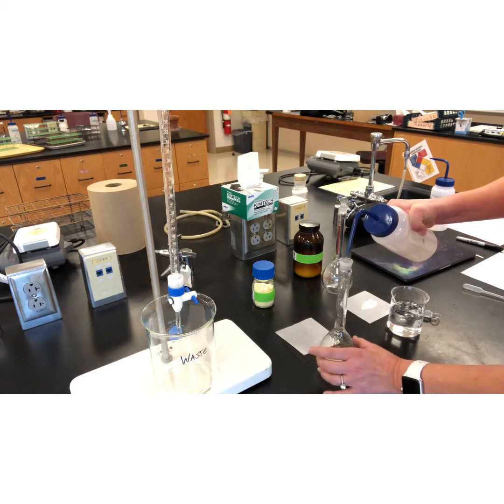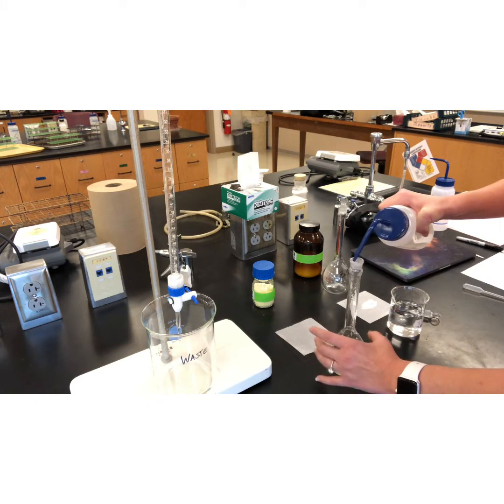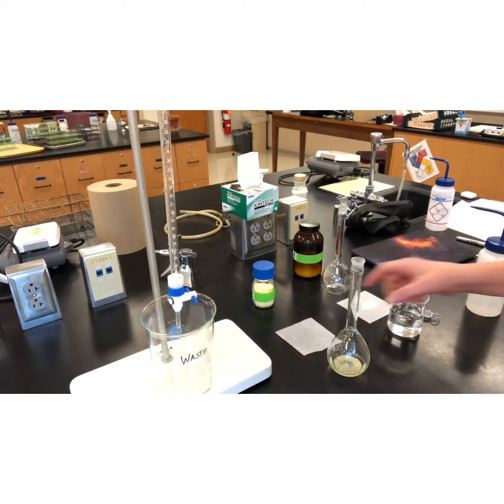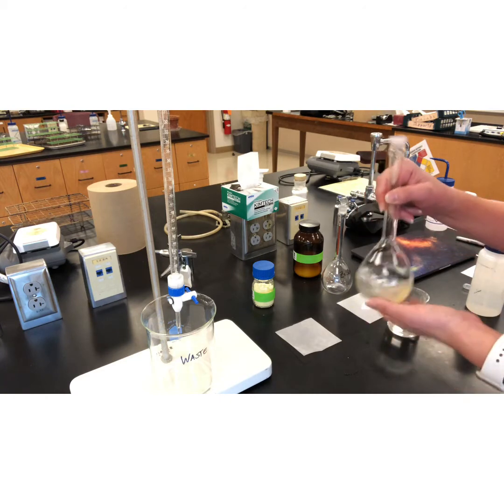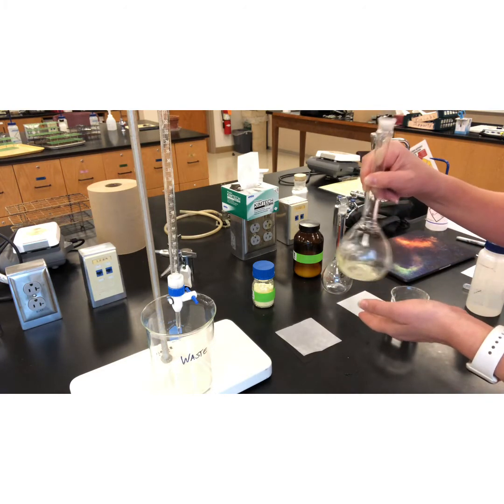One thing you do want to be very careful of is you don't want to go across that mark. You don't want to fill this up past the mark that tells you the exact volume of the solution. Once you go past that, you don't know the volume of the solution, and you will no longer be able to get that perfect volume. You have to start over.